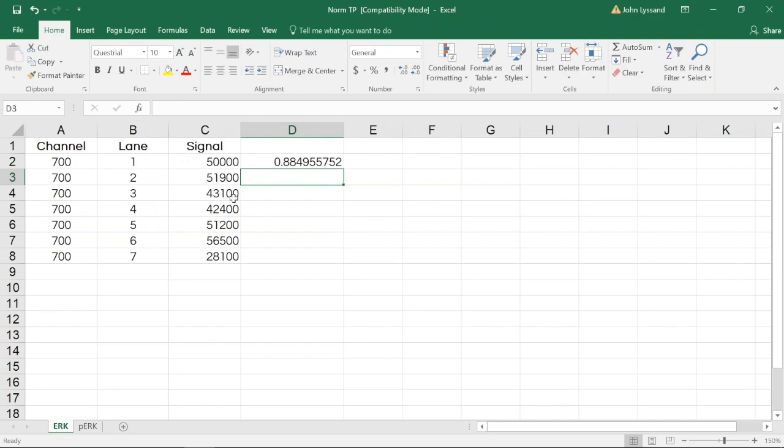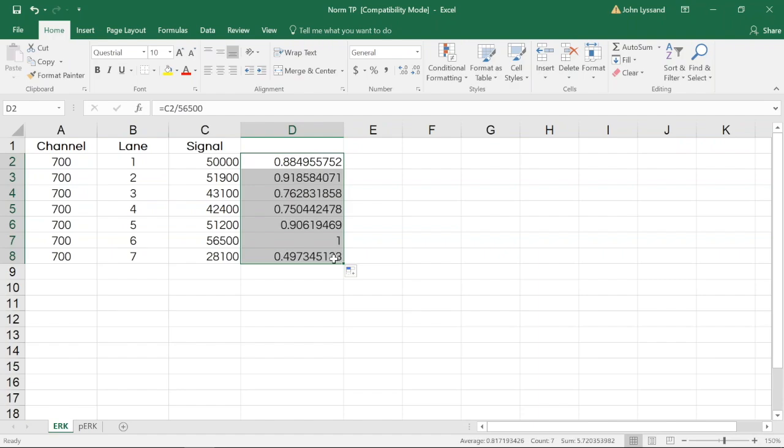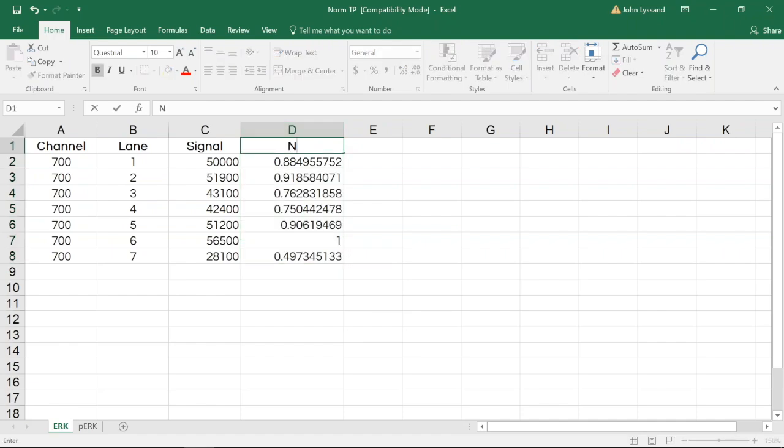By copying and pasting this equation, we can quickly apply the same formula to all lanes in Excel. This calculated value is our normalization factor, which we can type into the table for easy organization.